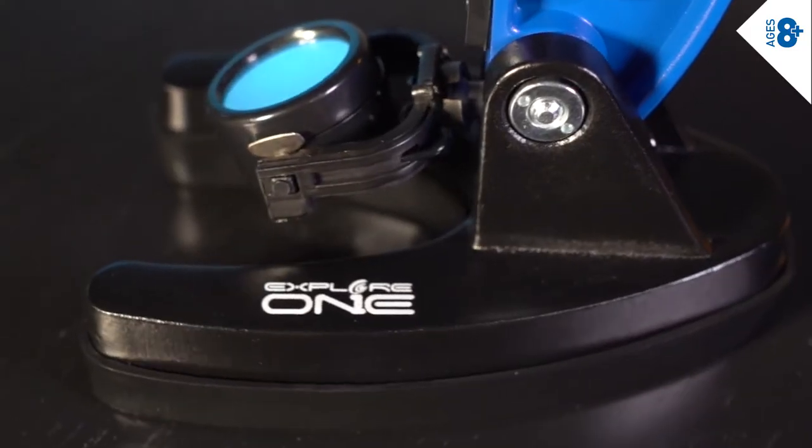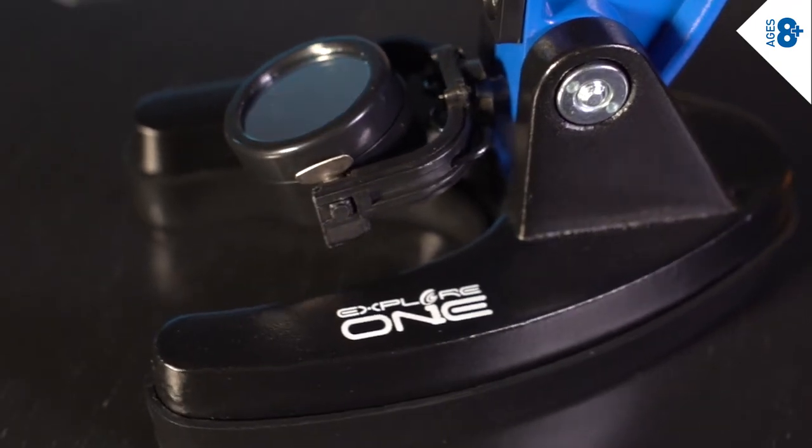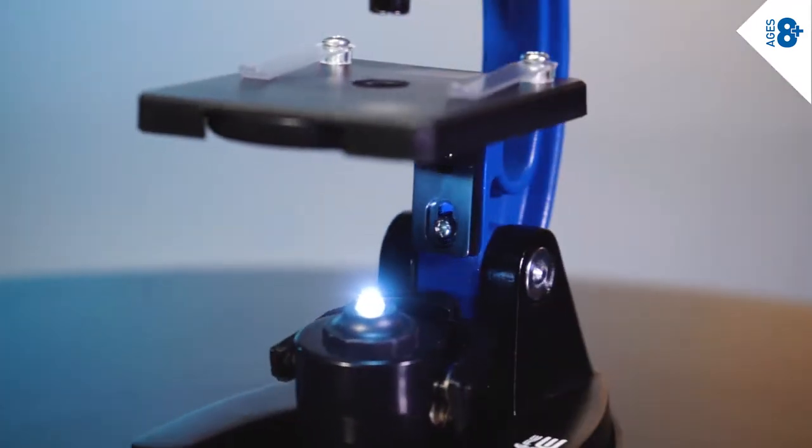The reversible illuminator combines a flat mirror for using ambient light and a white LED for illumination where you need it.